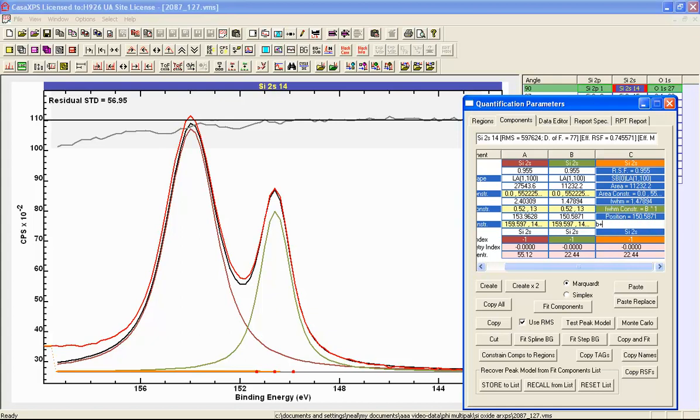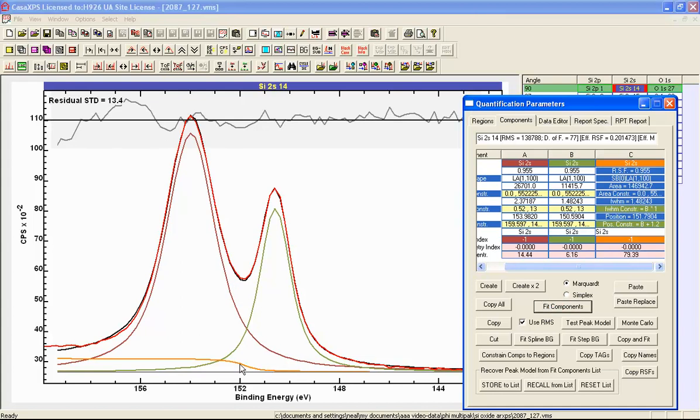So I'm going to introduce an offset that is representative of the band gap. This is an interval in energy where the inelastic scattering or any energy loss events should be deferred until after the band gap, where electrons can then scatter and interact with electrons that are within the solid state. So if I enter B plus 1.2, this provides a position from which the Shirley background will start to rise and then become flat.